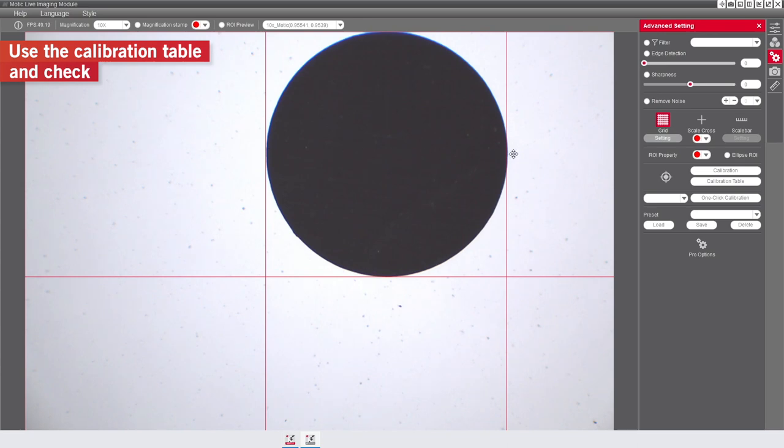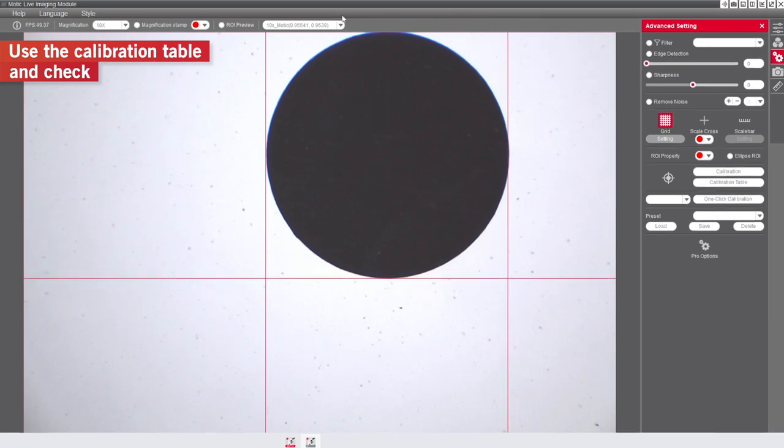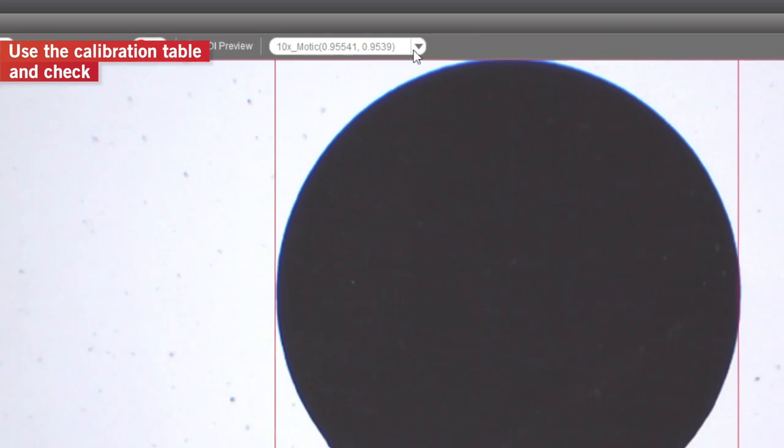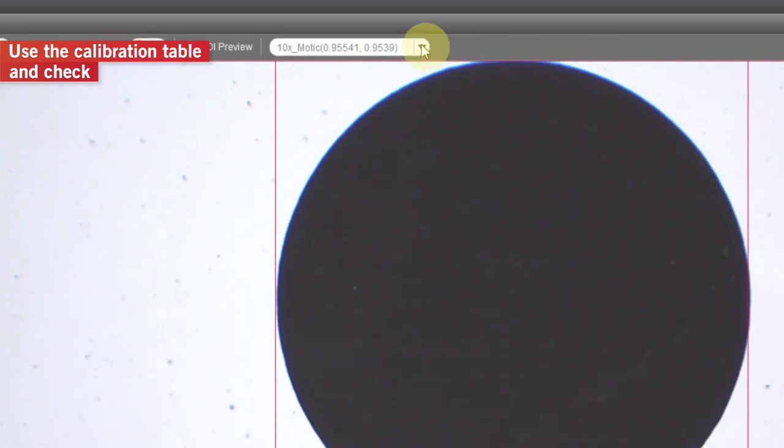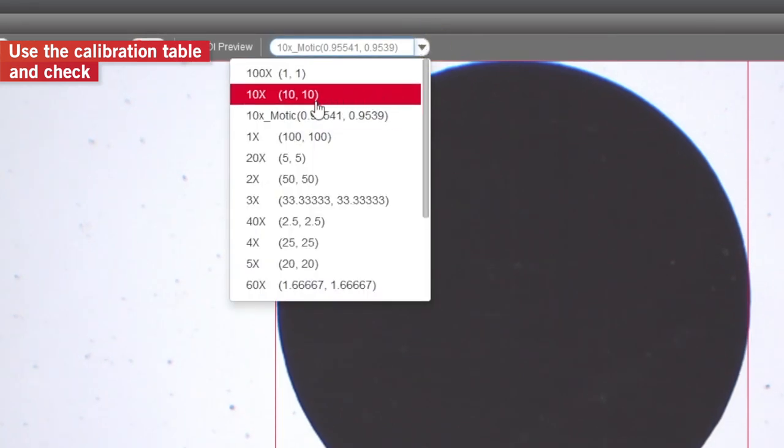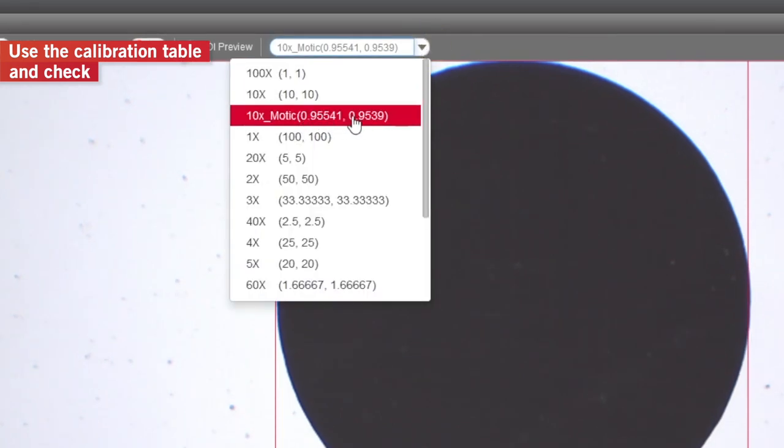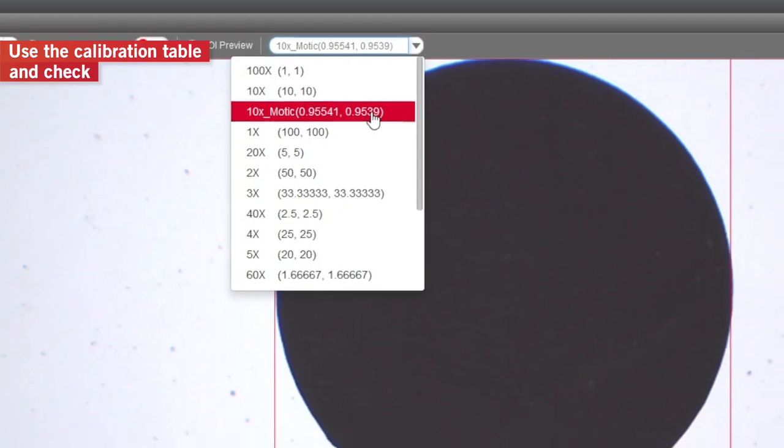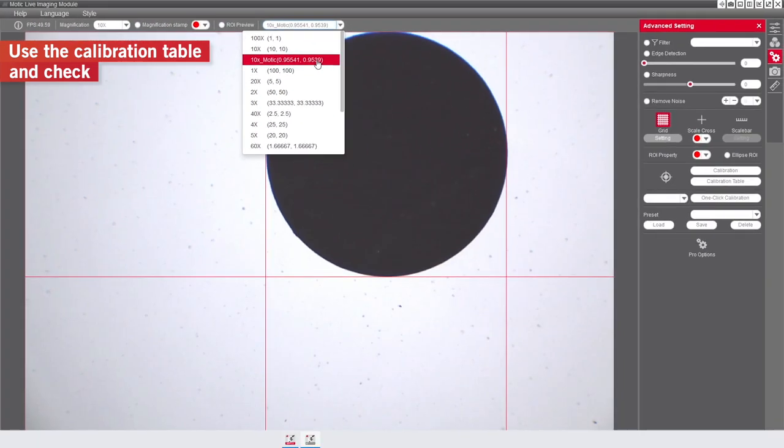Once the calibration is finalized, this new objective will appear in the drop-down menu of the Motic Live Image module, allowing you to select it. Follow the calibration configuration with all different objectives you are using.